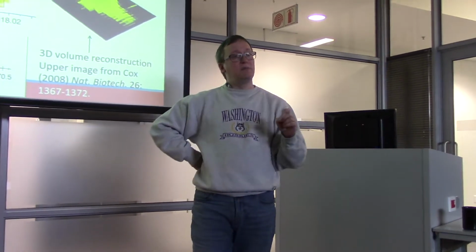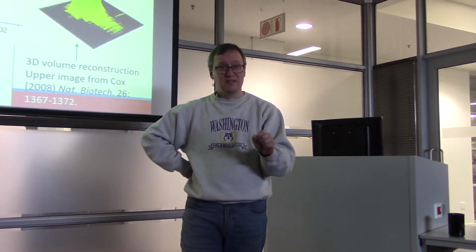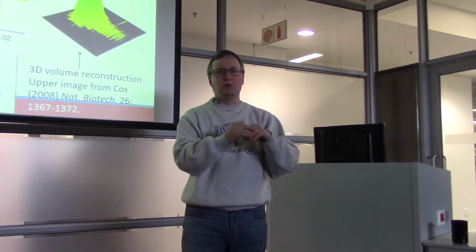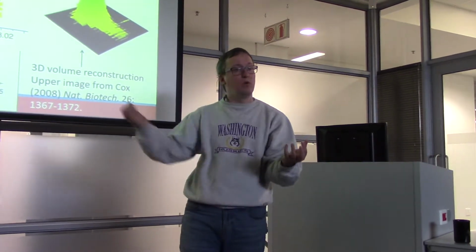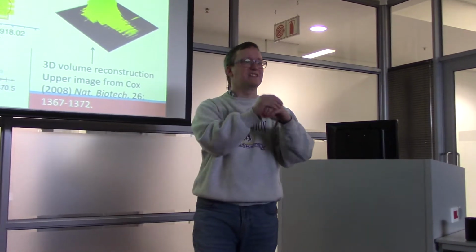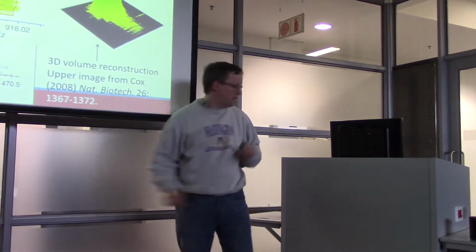I want you to keep in mind that what we are measuring in tandem mass spectrometry is peptides, not proteins. So how the software is able to deal with lots of peptides all being quantified in this way and wrap that up into a single protein intensity measurement is actually kind of complex and important. All right.